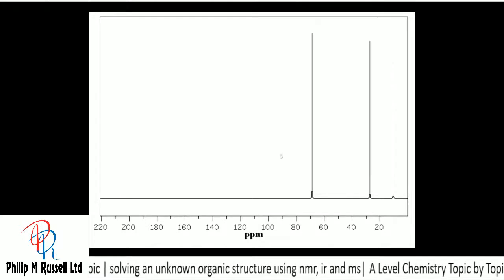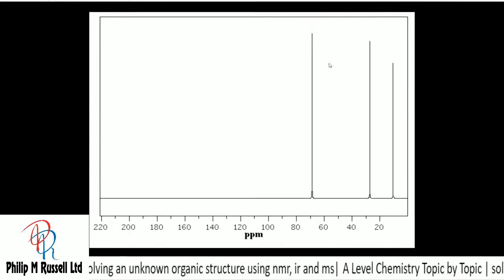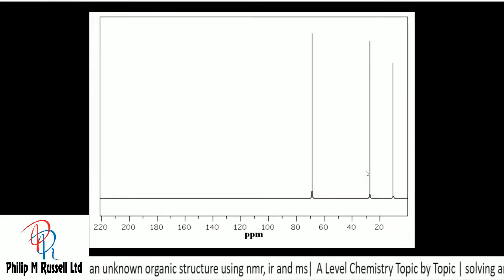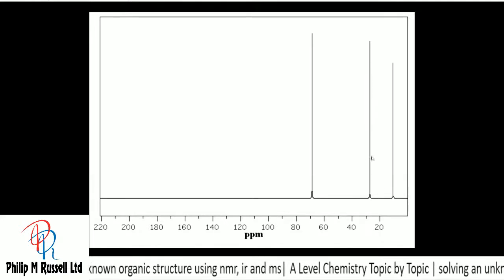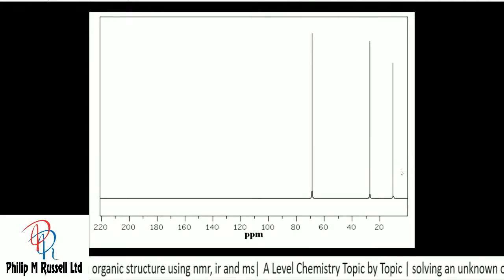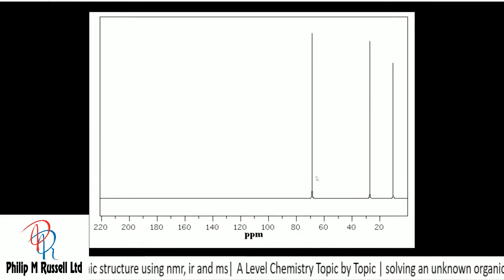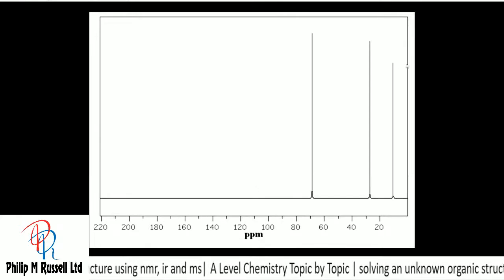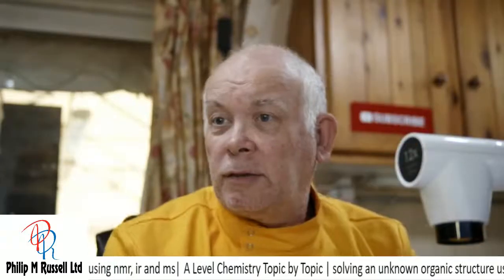There's a carbon there, but I don't think it's really that implicit. But these two are definitely part of the hydrocarbon chain. They're the ones surrounded by the hydrogens, so they're almost certainly the CH3 and the CH2s, possibly. So there are two hydrocarbons here, and this is just a carbon on its own, or possibly with an H. There is something funny about this carbon. This is a carbon that will tell us everything. So let's go in and see what we can actually find.